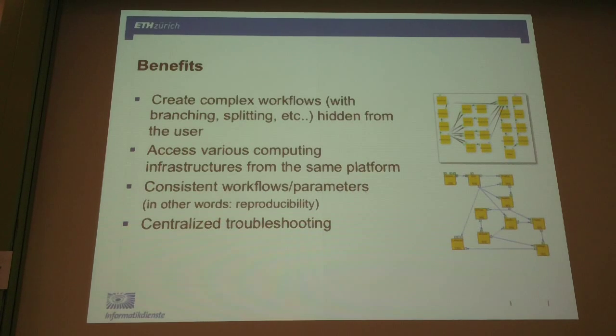So, especially for proteomics, you don't have just single tools, input, tool, output, but you have workflows, you have pipelines, and these tools are, as you already pointed out, horrible. They are different technologies. You create a TSV file, you need to convert it to an XML before putting it into the next tool, so it's a nightmare for users to use that software or these pipelines in a normal way. So this, for example, is a standard workflow for a protein identification. As you can see, if you do this with shell scripts, you end up for sure in a mess.